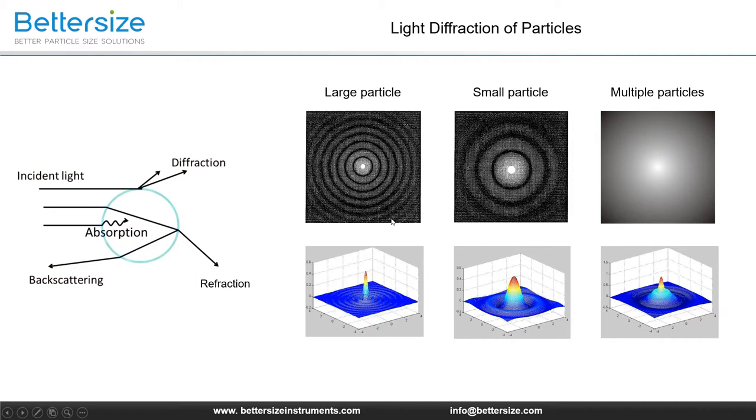If we visualize the laser diffraction as such an object in forward direction on the screen, a diffraction pattern with several intensity maxima and minima is created. A larger particle diffracts the laser beam less than a smaller particle. So, the light spectral diagram of the small particles must be recorded at larger angles by detectors. On the right, the scattering diagram on multiple particles that contains numerous small and large particles is shown.